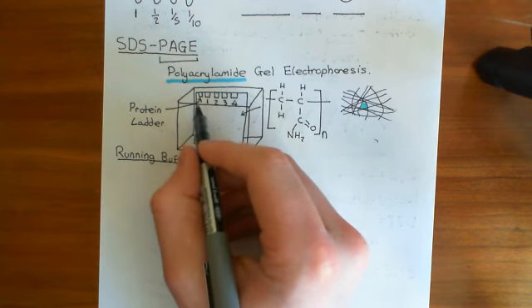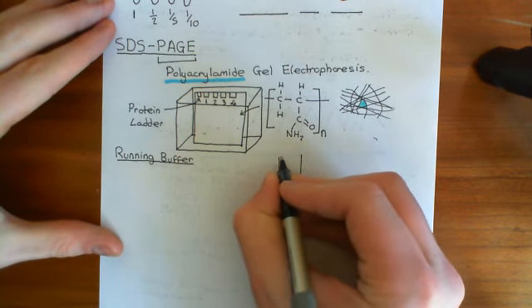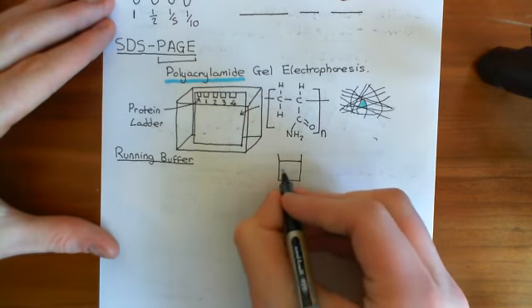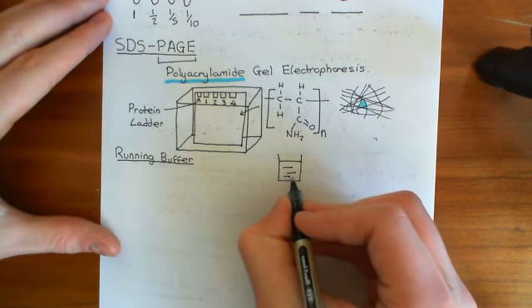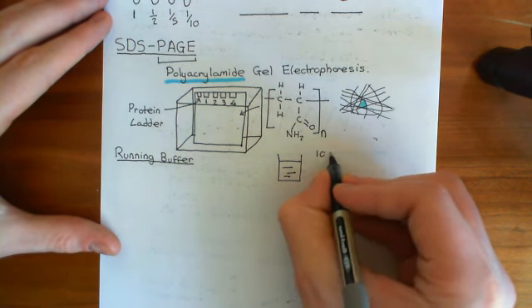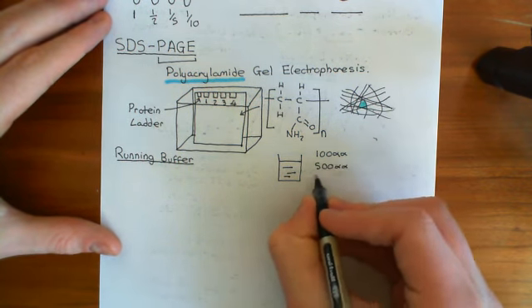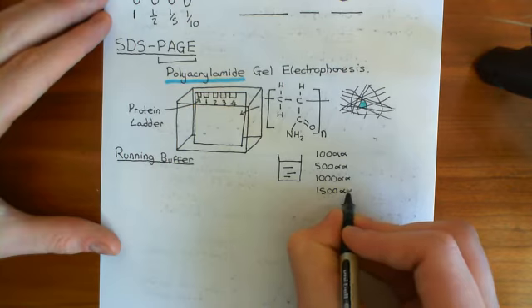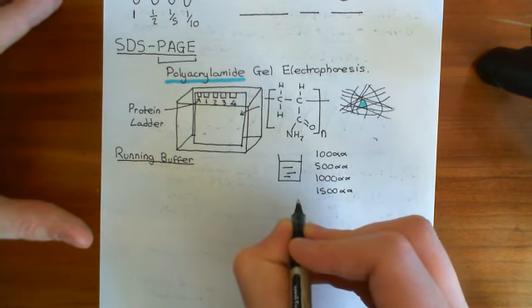And basically what a protein ladder consists of is a solution. So let's say here we have a little pot, and it will contain a huge number of proteins, and they will be denatured just like our proteins, so they'll be linear polypeptides now surrounded by SDS molecules, and you will have proteins of a set length. So maybe you'll have a protein of 100 amino acids, and that will get very far. Then you might have one of 500 amino acids, maybe one of 1,000 amino acids, maybe the next one will be 1,500 amino acids. So you will know exactly what the lengths of the polypeptides in here are.